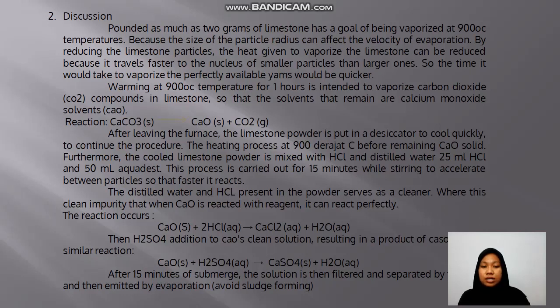Then H2SO4 addition to the clean CaO solution results in the product CaSO4.